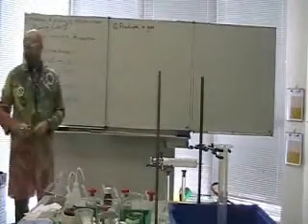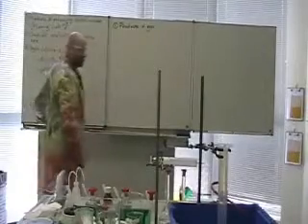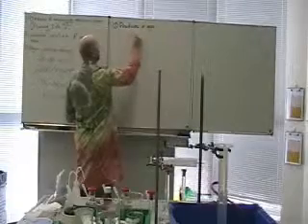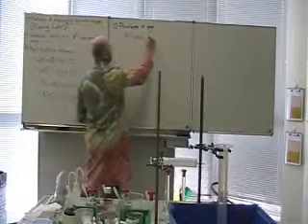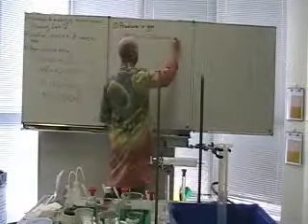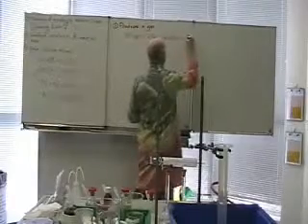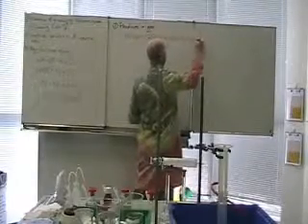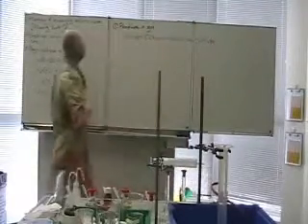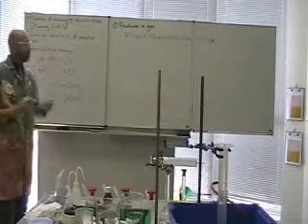Anything that produces a gas is a wonderful reaction to use, okay? The one that I'm actually going to use right now is hydrochloric acid plus calcium carbonate makes water plus CO2 gas plus calcium chloride. So anything that produces a gas is good to go.